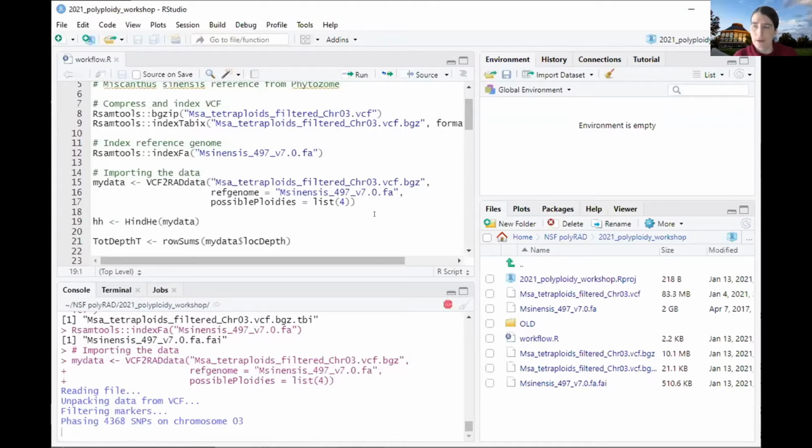The things that we're going to do here are going to be more along the lines of, I assume it's tetraploid. Is it behaving like a tetraploid? Or is it behaving like something else? And if it's behaving like something else, maybe I just want to throw it away. Yeah, based on doing this before, the import step is roughly a third of the way done. So I have time to answer some other questions if there are any.